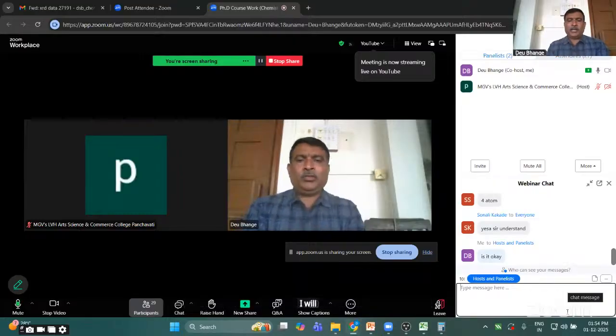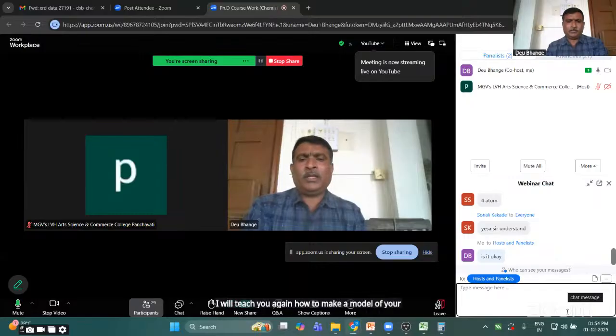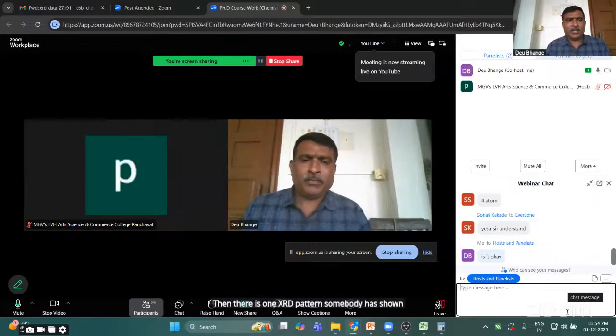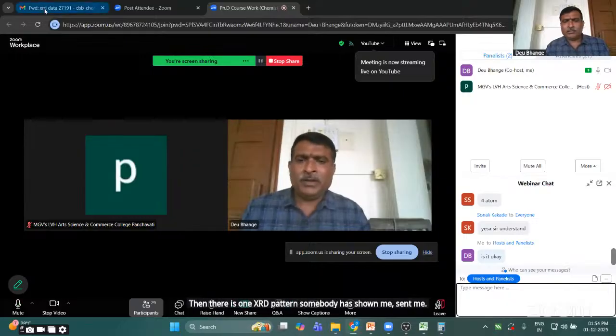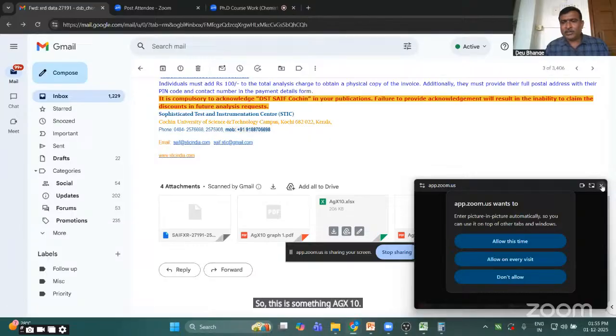I will teach you again how to make a model of your own material. Then there is one XRD pattern somebody has sent to me. So this is something AGX10, AGX10.